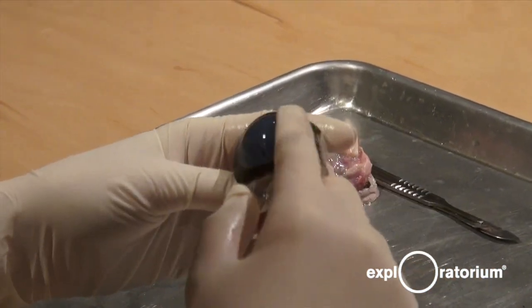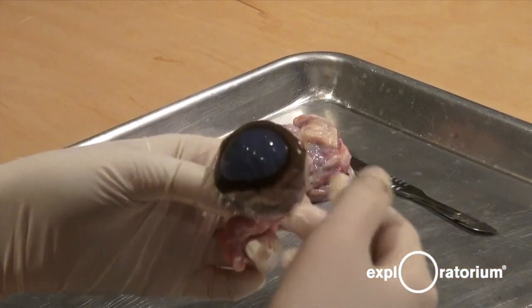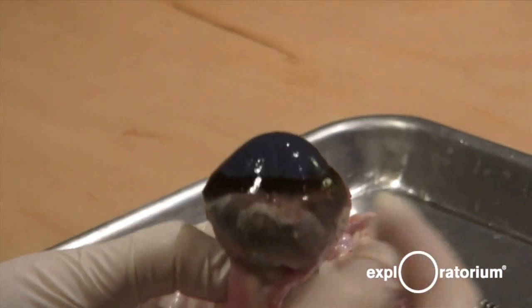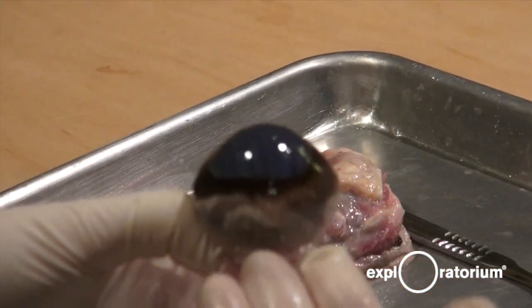The cornea has two main functions. It protects to make sure things don't get inside the eyeball, but it also focuses light. You can see that it looks a bit like a magnifying glass with a nice round shape. This does most of the focusing — about 70 to 80% — versus something inside the eye does the rest.